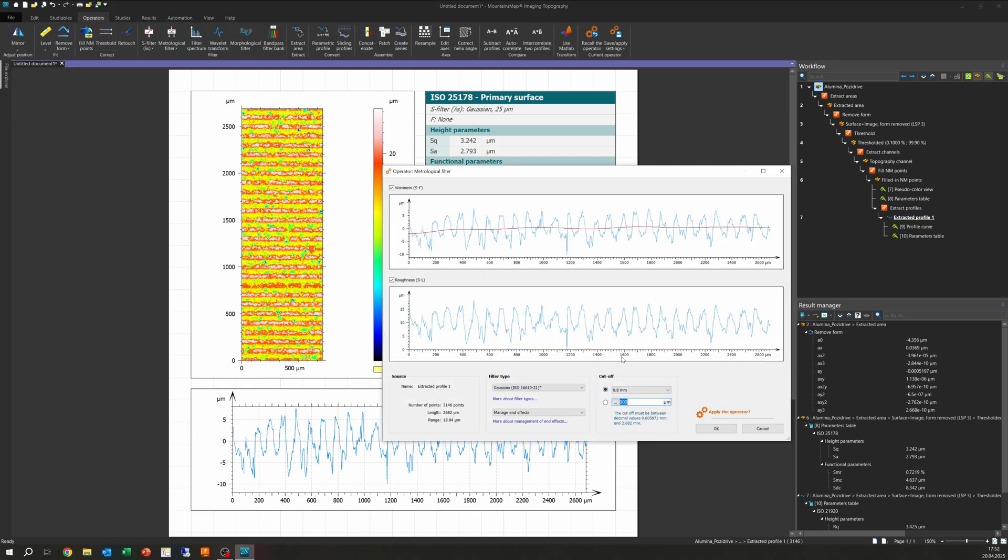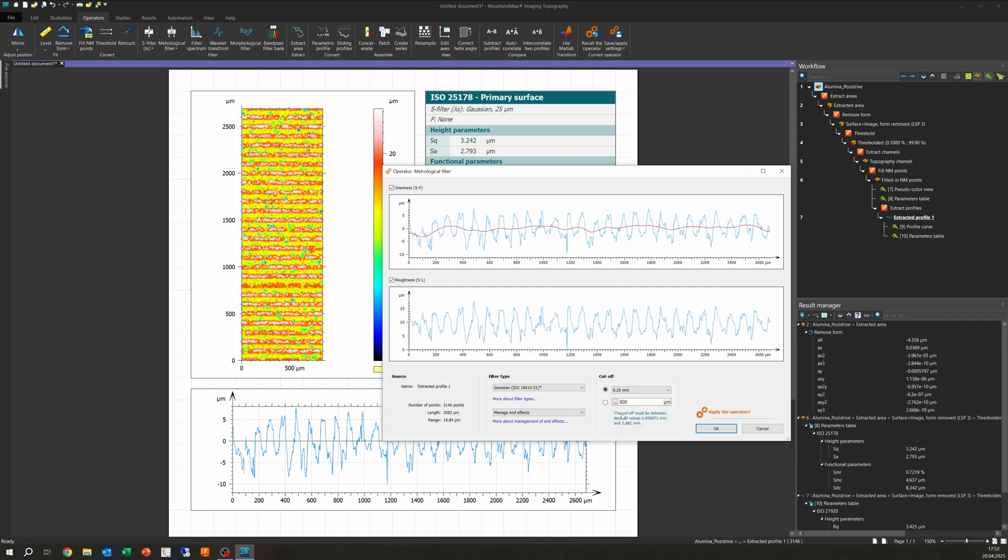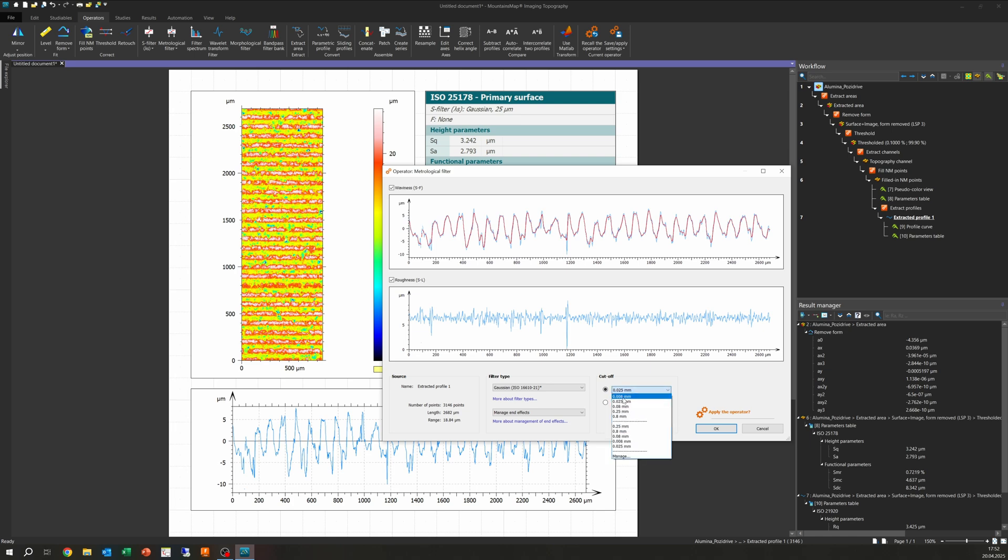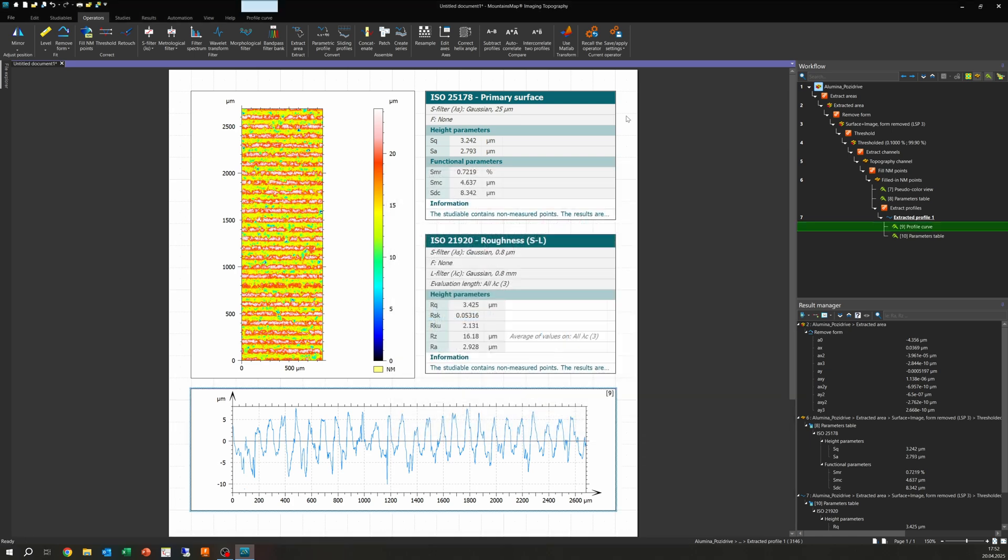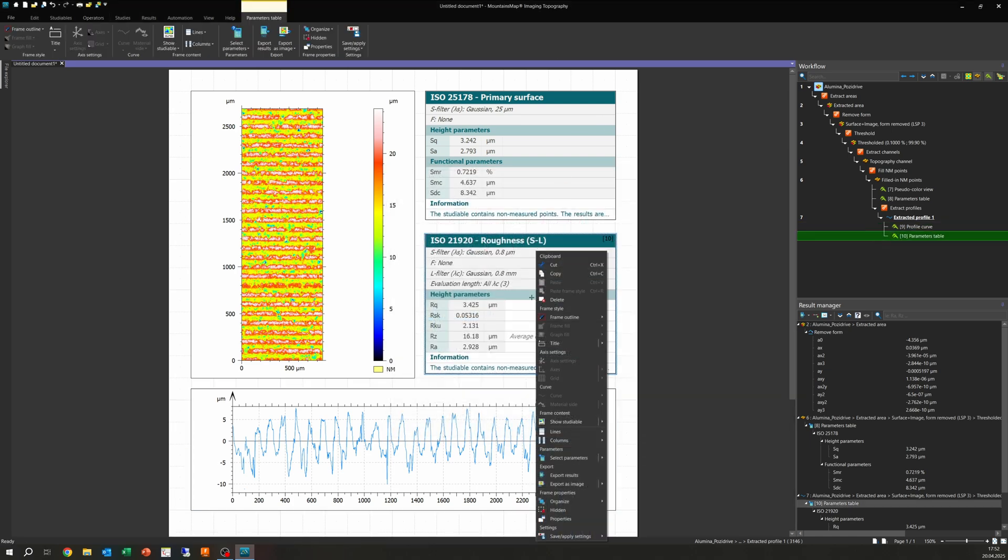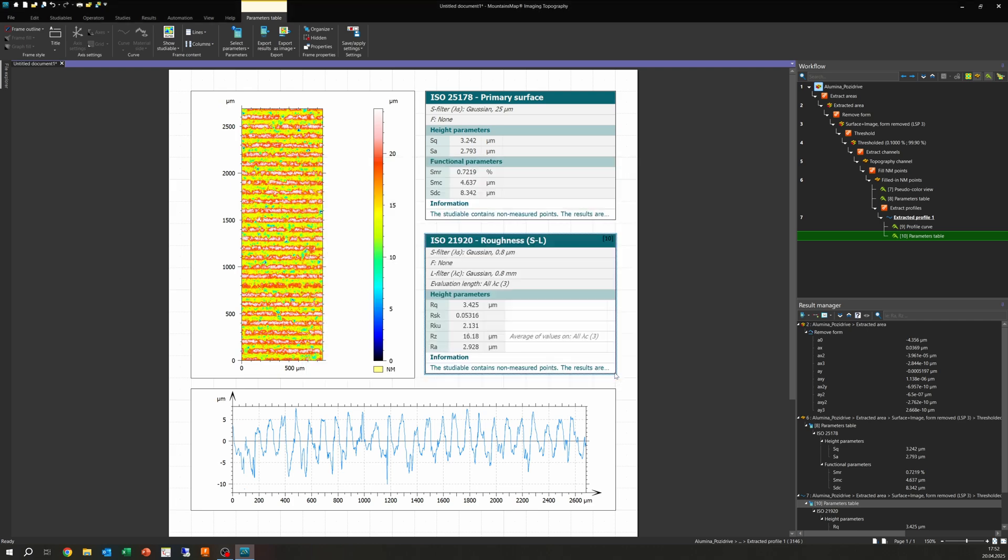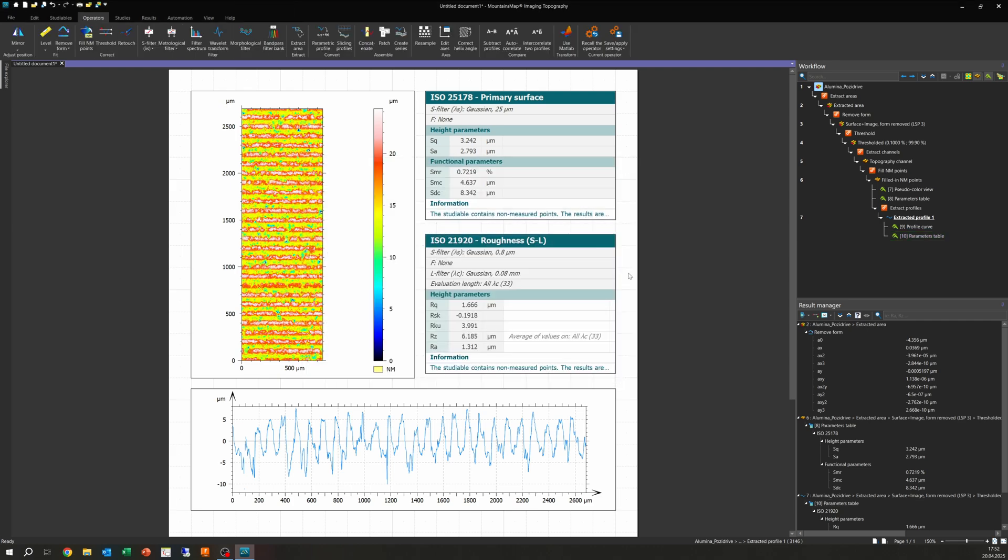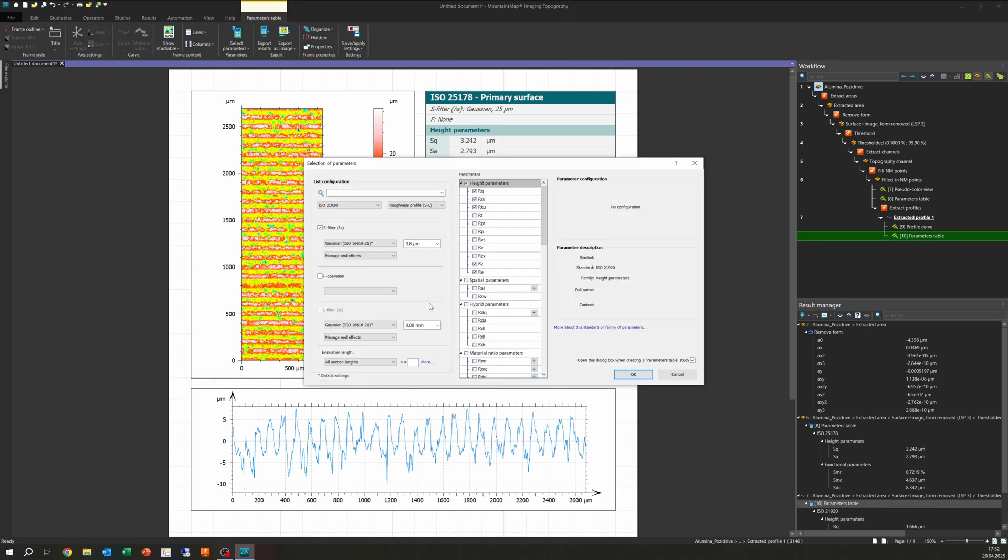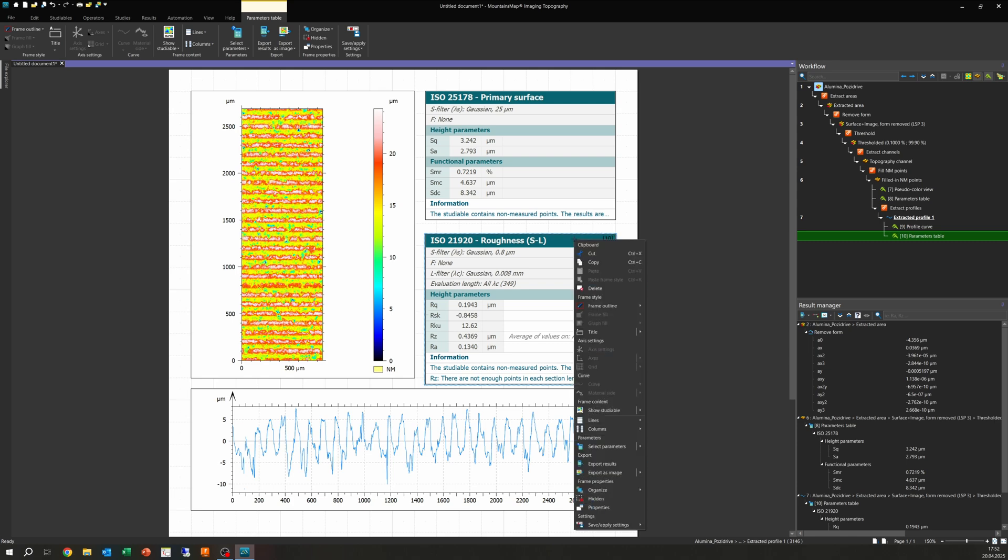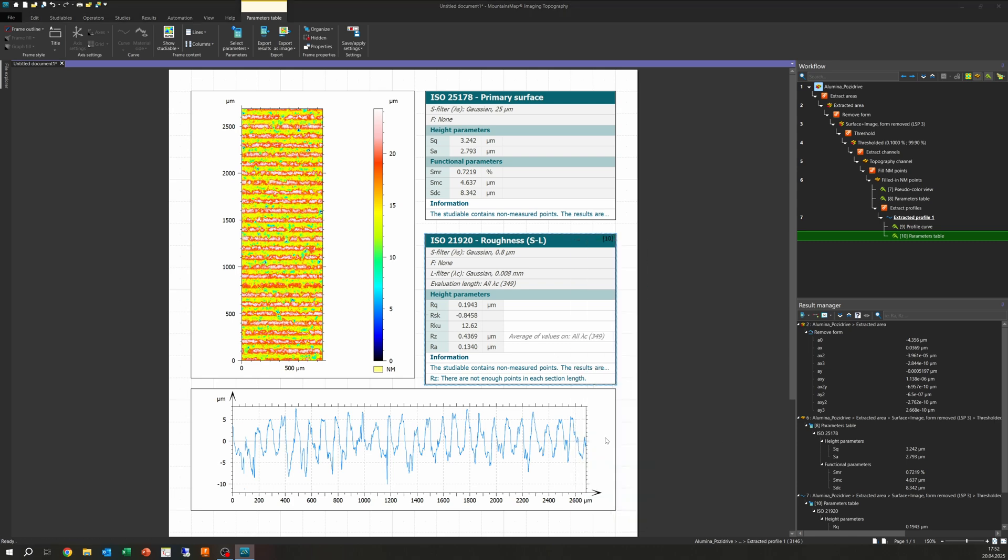Here, the red line shows the effect of the filter. You can see that at small cutoffs, we are filtering away most of the profile, which would improve the surface roughness value drastically, but not be really honest. To maybe show it directly here in the filter, if, for example, we change the setting from 0.8 to 0.08, our roughness more than halves, RA 1.3. If we go even further to 8 microns filter, it's now 0.13 micrometers, which would be a spectacular result for aluminum oxide.